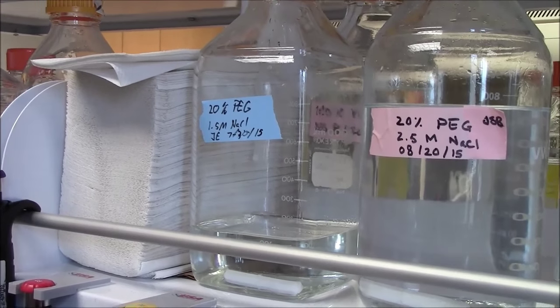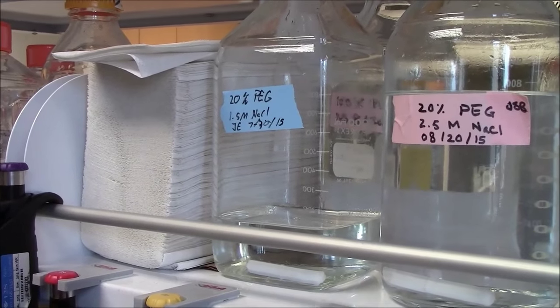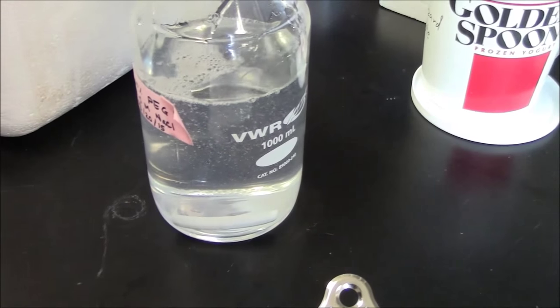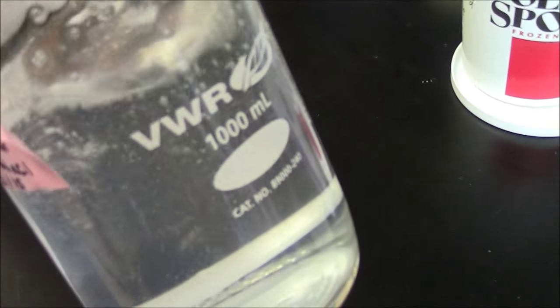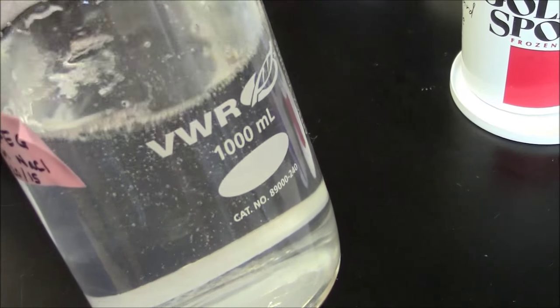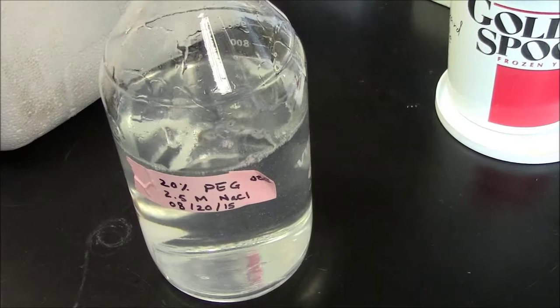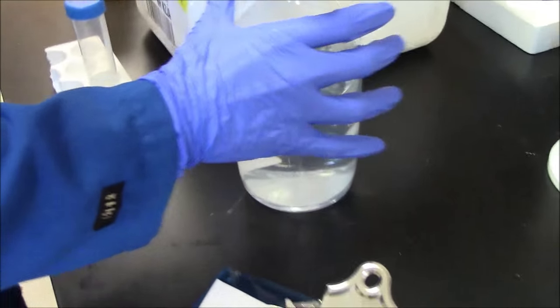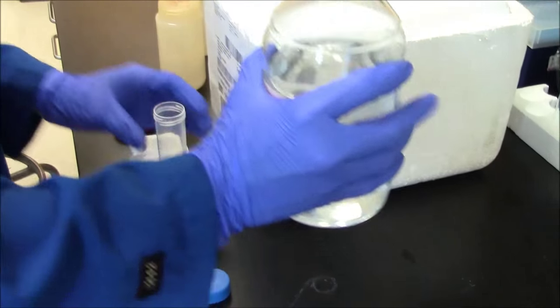While the cells are spinning, you can prepare your PEG NaCl solution and chill it. Use the 20% PEG, 2.5 molar NaCl. It'll be very viscous. You can see here that the bubbles are very slow returning to the surface because it's a gooey solution. And you can pre-chill that in centrifuge bottles.